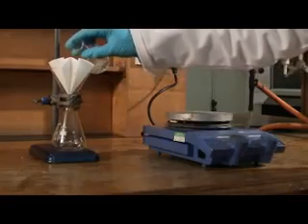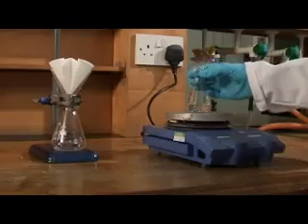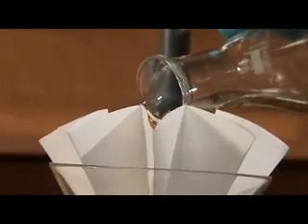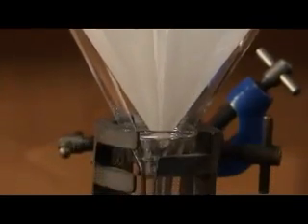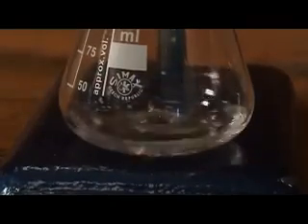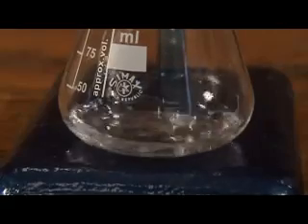Pour just a small amount of the hot solution into the bottom of the filter paper. Keep adding a small amount at a time — don't be tempted to pour it all through at once. In this case the product is still in solution, though sometimes crystals will start to appear as soon as the hot solvent hits the cooler flask.